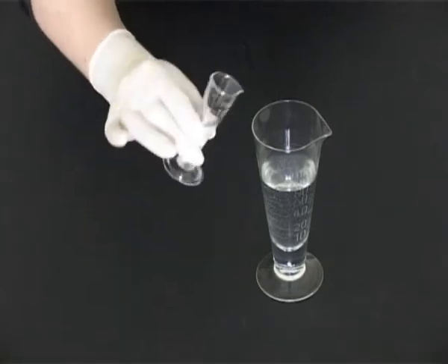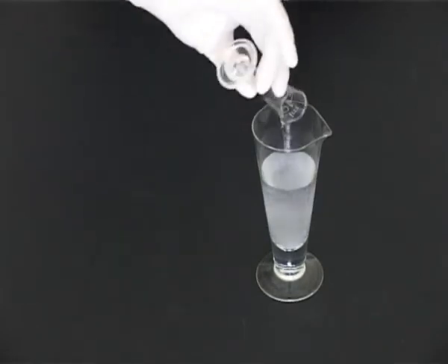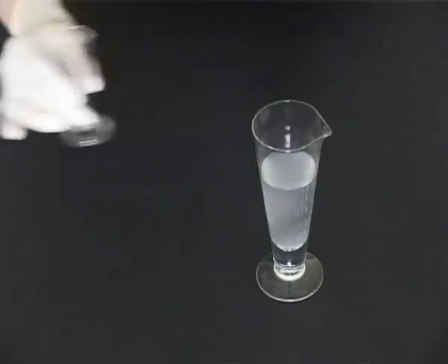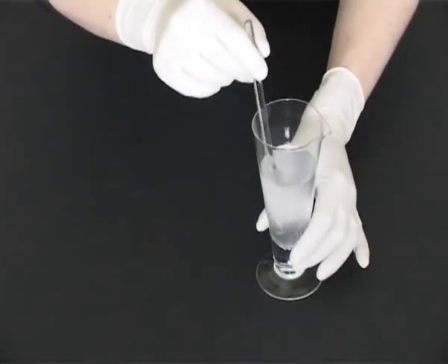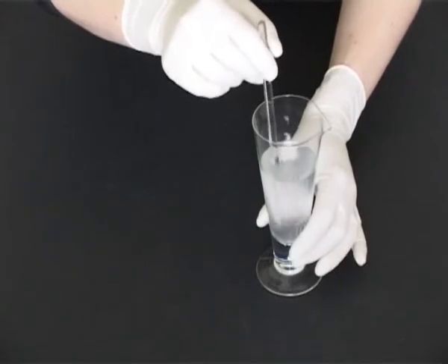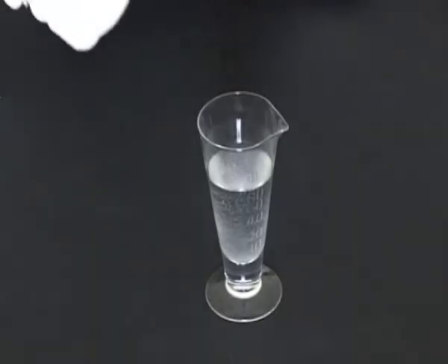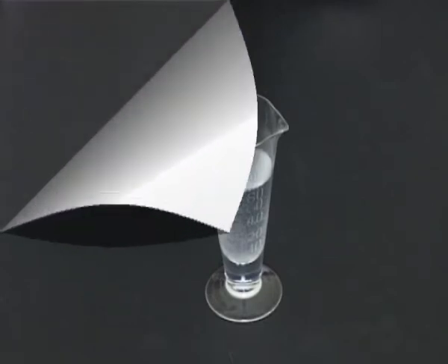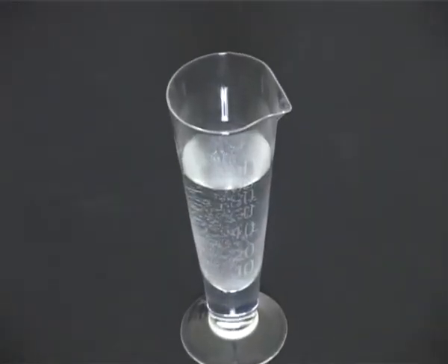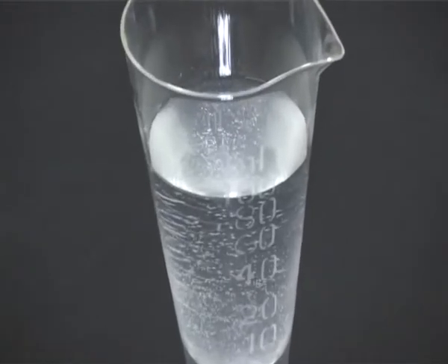To prepare 100ml of double strength chloroform water, measure approximately 90ml of potable water in a 100ml conical measure, and to this add 5ml of concentrated chloroform water. Remember, always add solute to solvent. Stir and make up to volume, remembering to remove the stirring rod. 100ml of a clear solution of double strength chloroform water is produced.